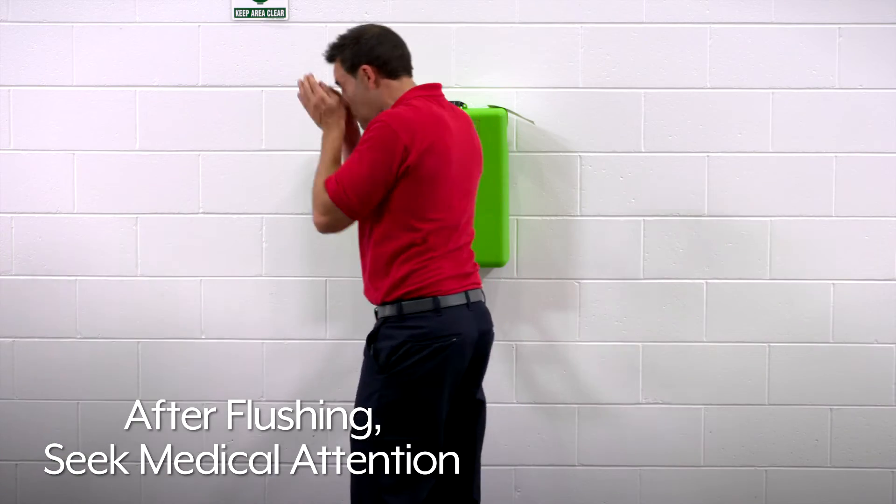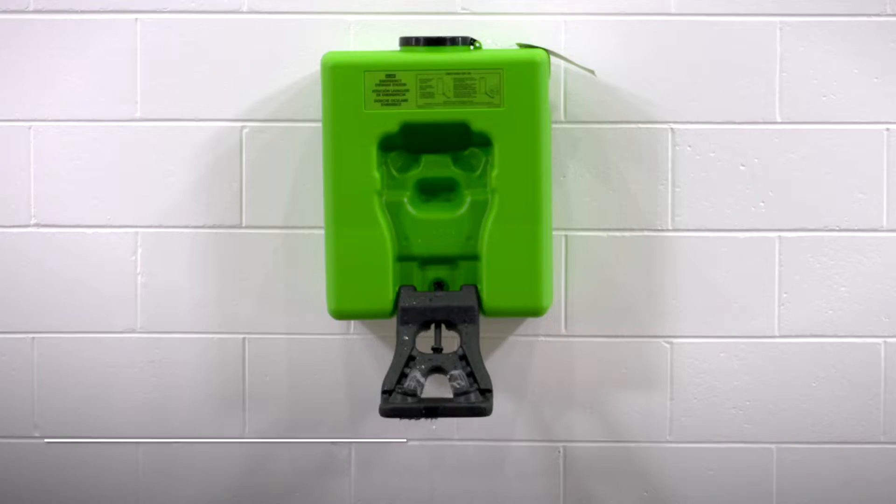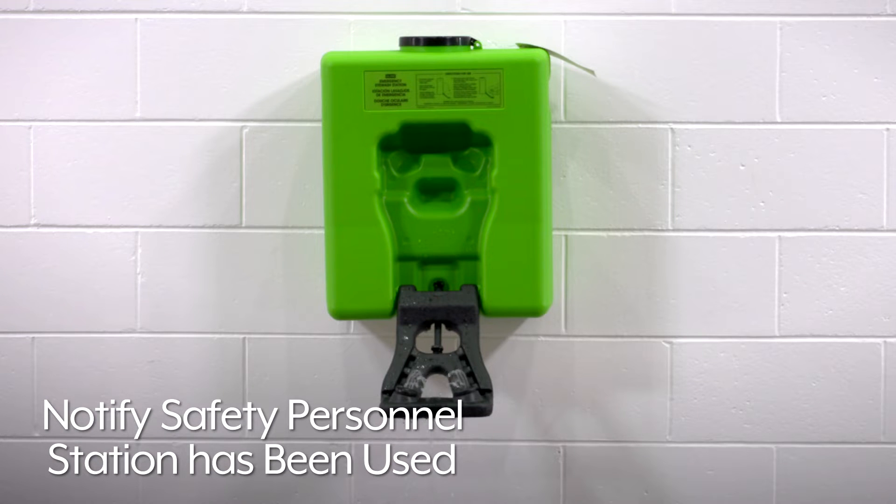Immediately after flushing, seek medical attention and notify safety personnel that the station has been used and should be refilled.